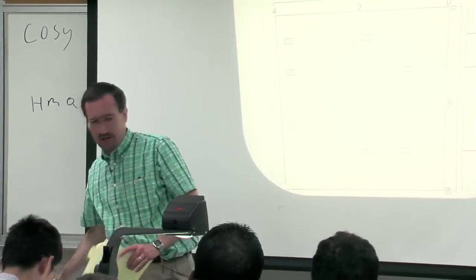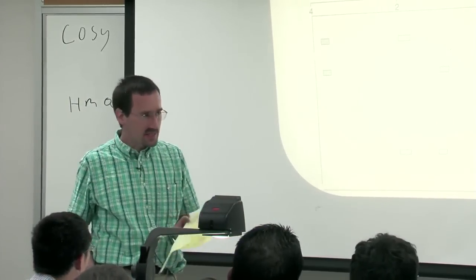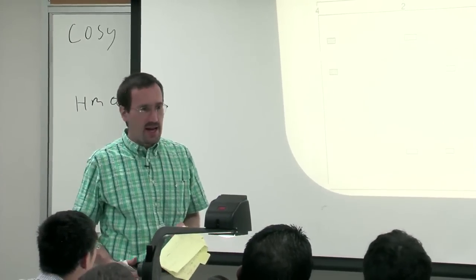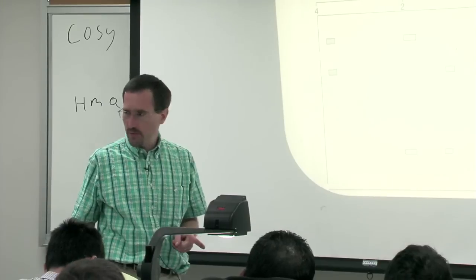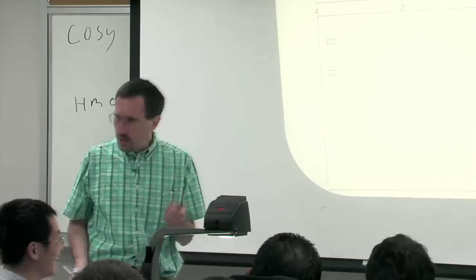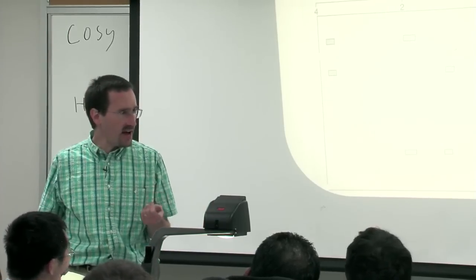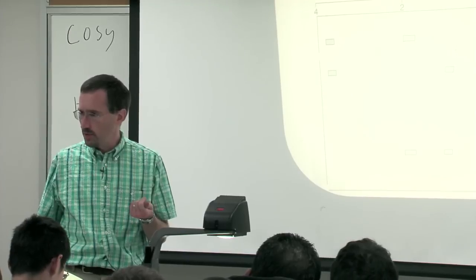There's no single bond coupling? Great question, James. Yes, you will sometimes see single bond coupling. Your textbook actually removed it from a few of their problems, and I put it back in. What good is it to have spectra in a textbook that are doctored when you then encounter real spectra?